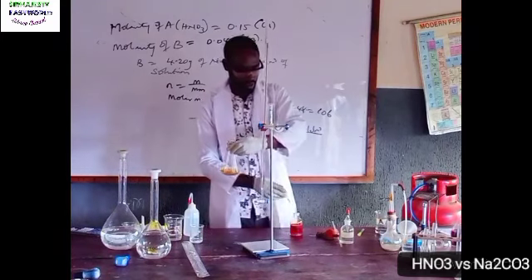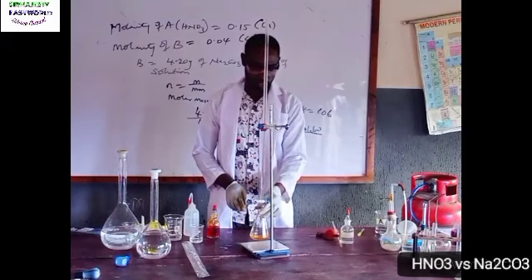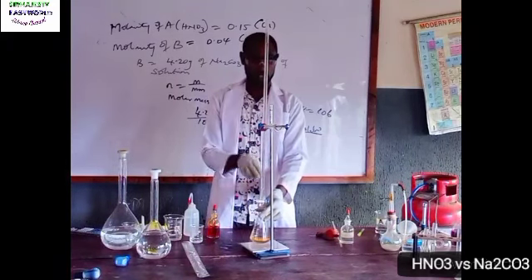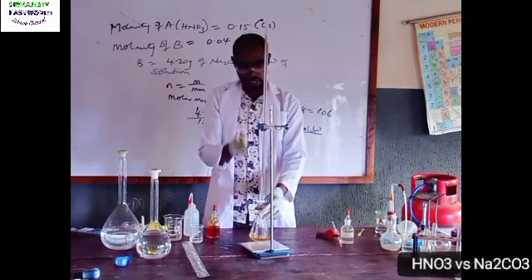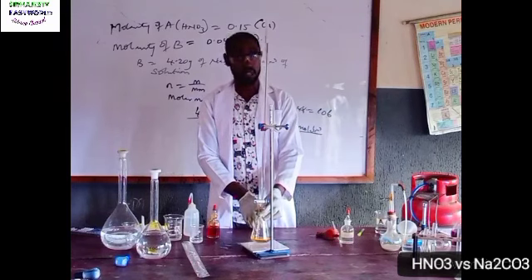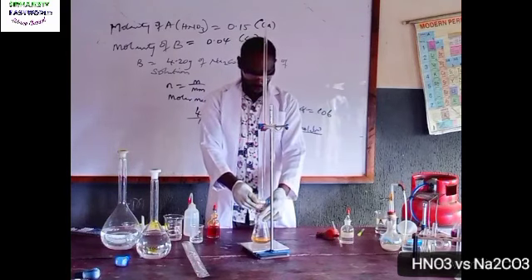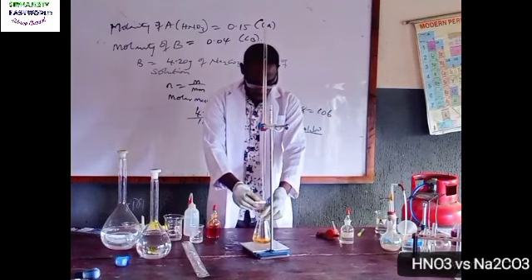See the color, it has indicated yellow. So the first titration is seen as rough, and in your first titration there is nothing that concerns you with looking at the buret, really. You look down into the mixture inside the conical flask as you add, so that you can detect immediately when there is color change.